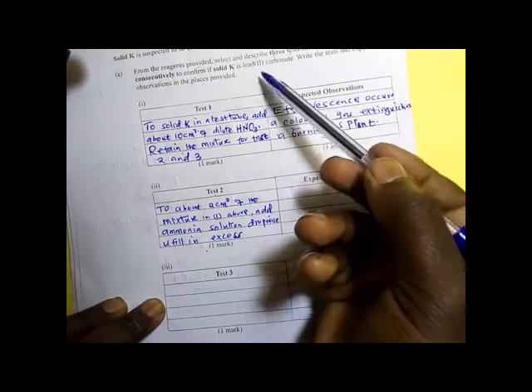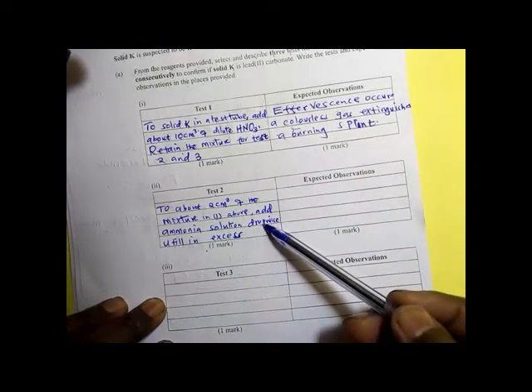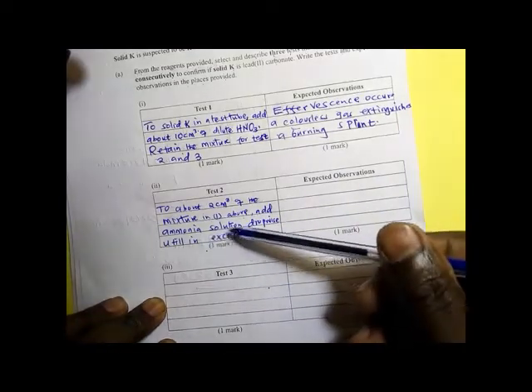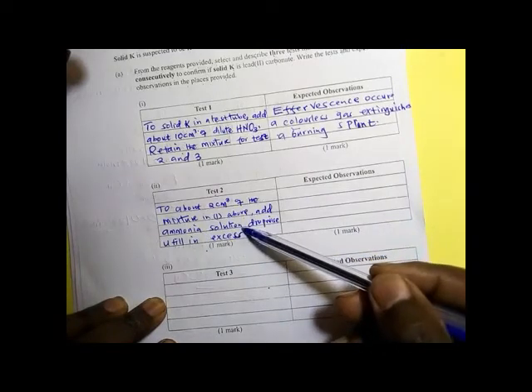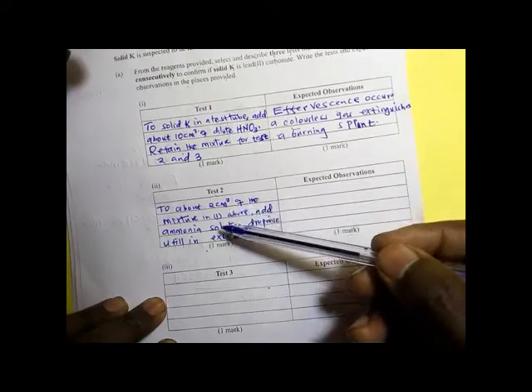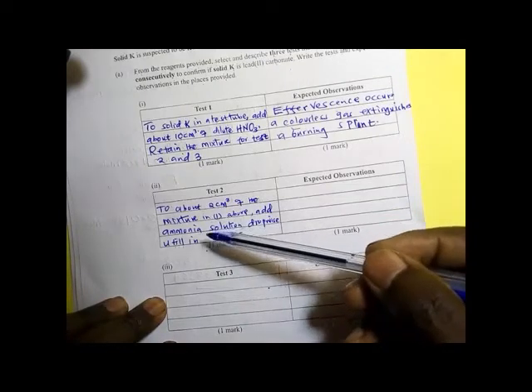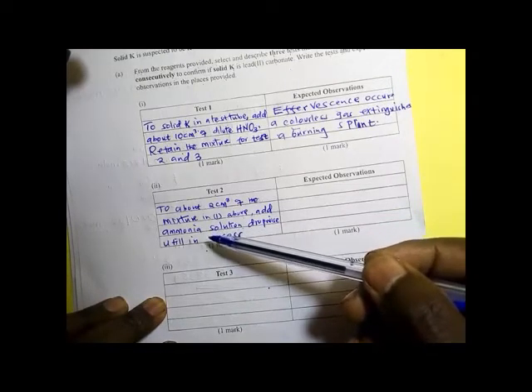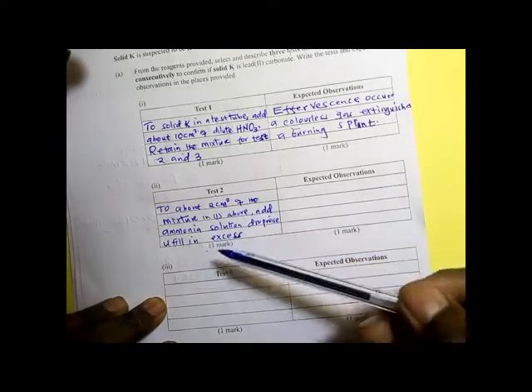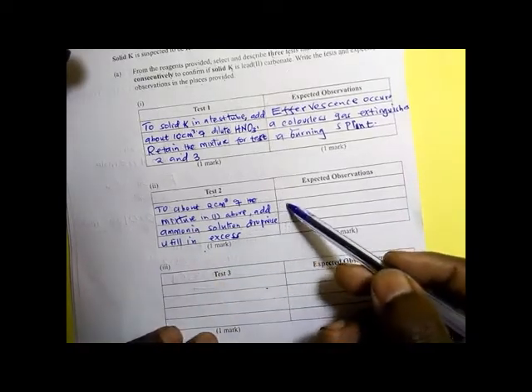So because we are expecting lead, what happens when ammonia is added? Suppose lead was in that solution, what will ammonia do? Ammonia will form a white precipitate, and that white precipitate will be insoluble in excess. Remember, when you add ammonia dropwise, a white precipitate is formed, and in excess the white precipitate dissolves to form a colorless solution that confirms zinc ions. But if it does not dissolve, then there are other ions inside, like aluminium.